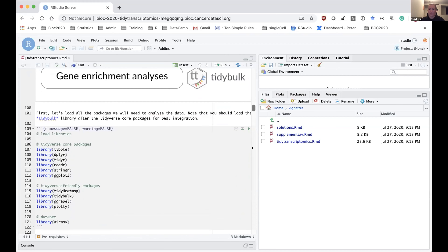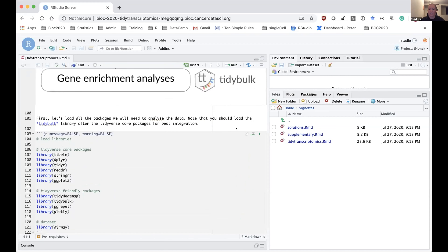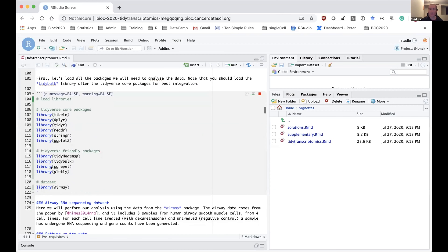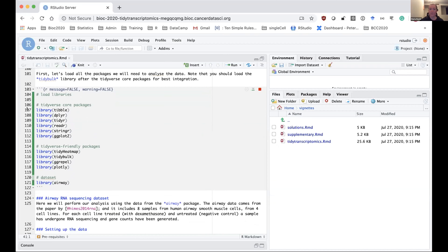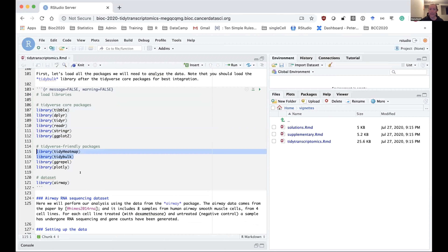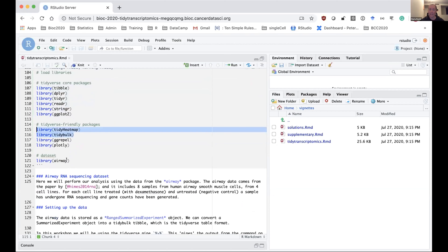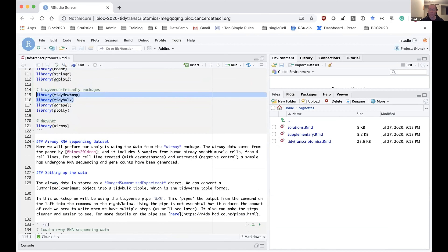For this demo, I'm going to be running the chunks of code and then explaining what's happening. First, I'm going to load in the packages we're going to use today. These are tidyverse core packages, and then the two packages — tidybulk and tidyHeatmap — created by Stefano, plus some other small packages we'll use.